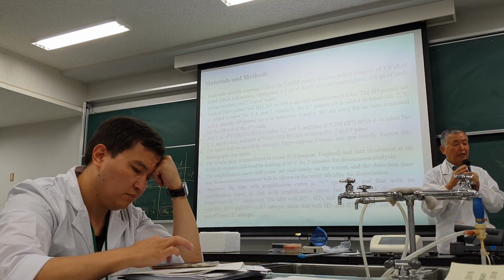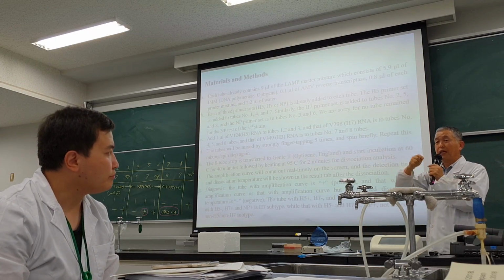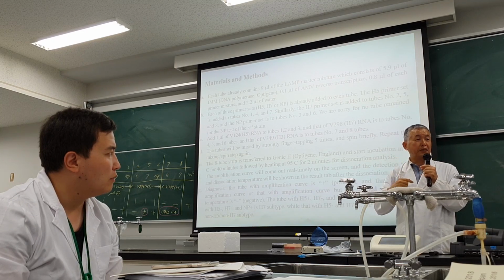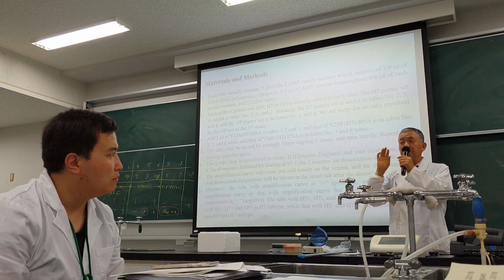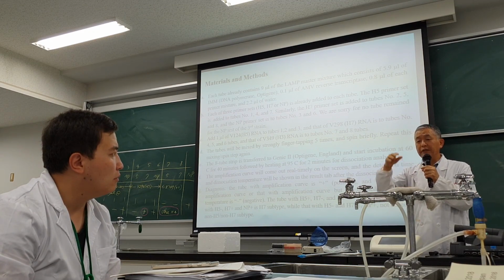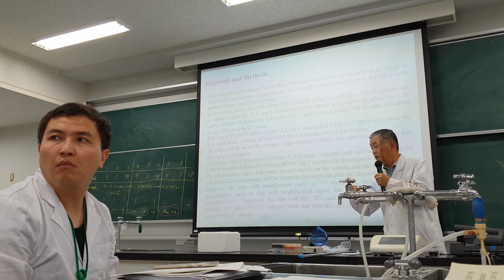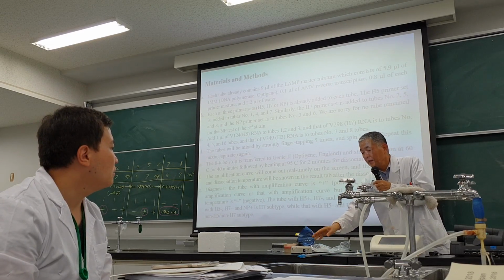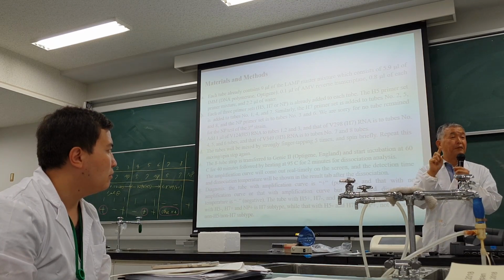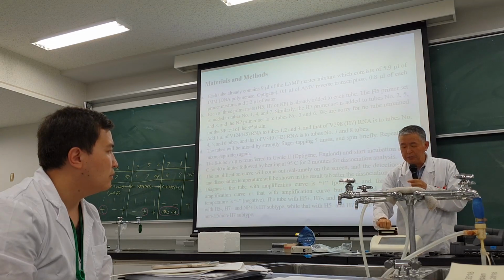Okay. Today we don't use pipetting. Add a sample and push the cap until we hear the lock sound. Okay, and mix by finger. And then we have the microcentrifuge here, spin briefly, and mix again by finger. 2 times, before and after. And start the incubation here.